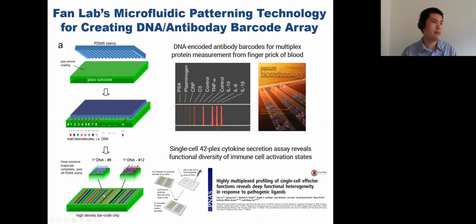We can make a high-density DNA barcode by simply flowing the DNA solution in and dragging it up. So this film will be filled with strips of DNA capturing spots. Then you can capture the target DNA. Another thing you can do here is an antibody-based barcode chip, so that you can capture either immune cell-released cytokines, or any blood proteins.